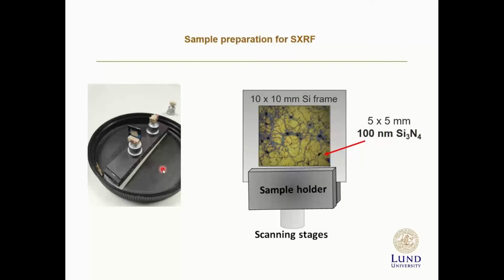First, we did the optical photothermal infrared experiment because it doesn't destroy the sample. After that, we used the X-ray fluorescence experiment to study elements in the sample.